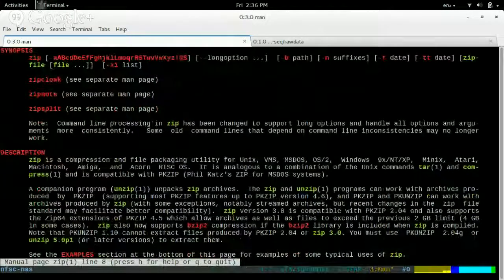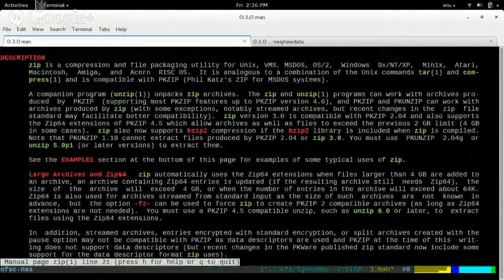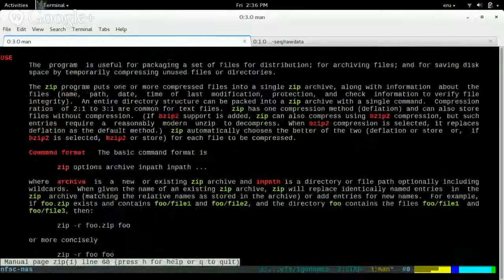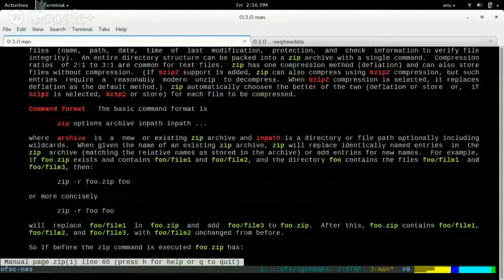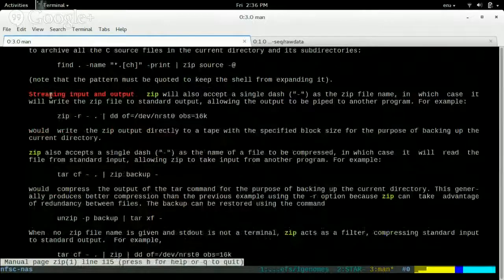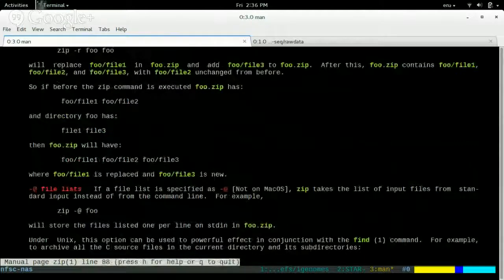what you can do with it is, when you're first starting off, you might want to just uncompress everything if you have the space. The problem is that'll use a lot of space, and especially on the cluster, I don't know how much quota Cronty gives you, so you may run out of space before you are able to unpack everything. But that's okay because most of the time you can just stream it into the program you're working with and then stream it back out into some compressed format so that you're never actually working with the uncompressed files all at once. And so to do that for zip, I'm trying to remember the command line.